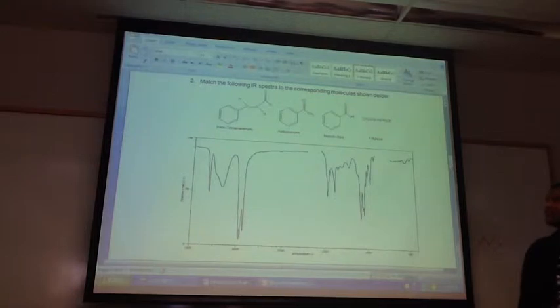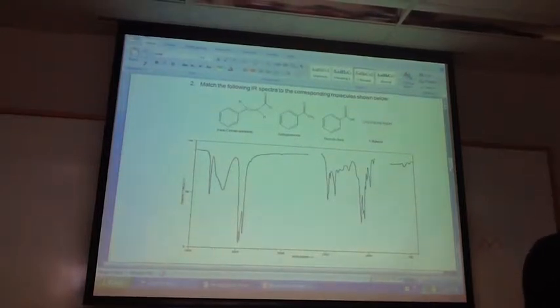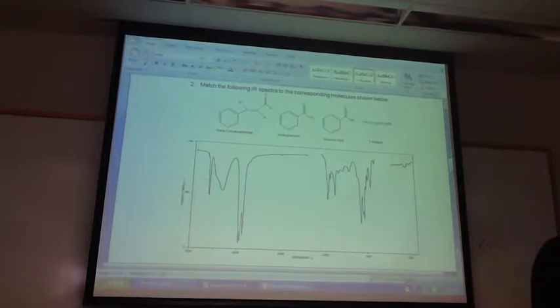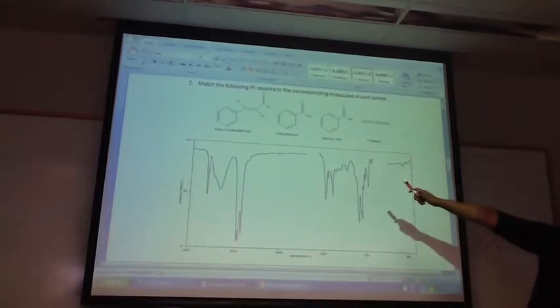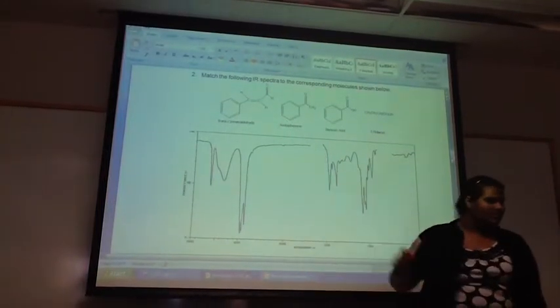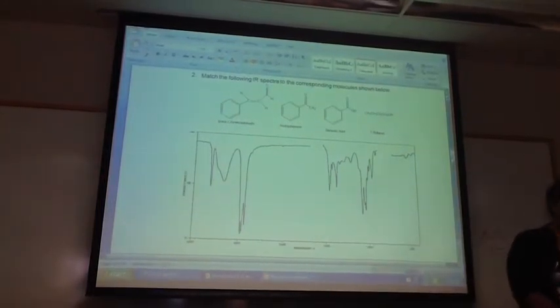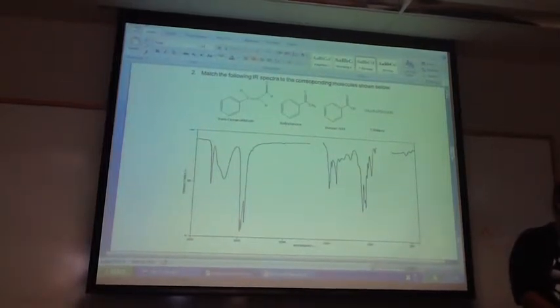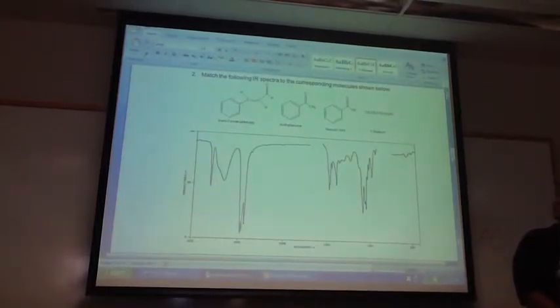So let's start with trans-cinnamaldehyde. What are the functional groups in there, Martha? An aldehyde. That's a benzene.